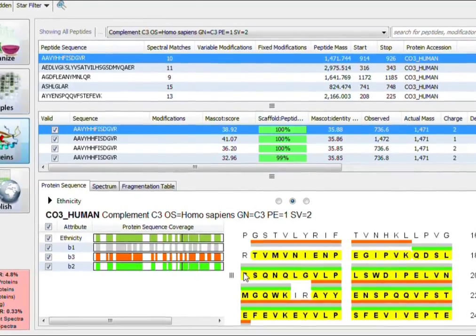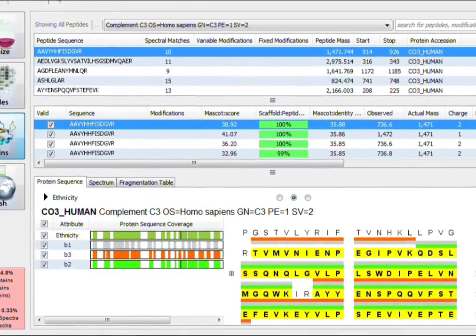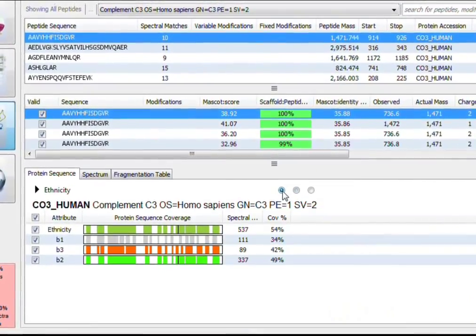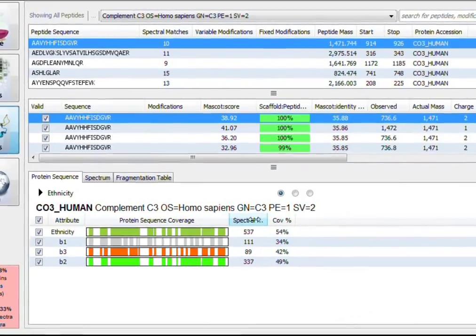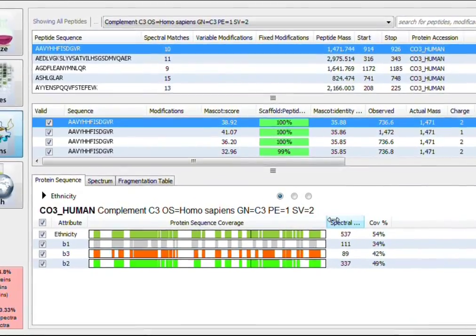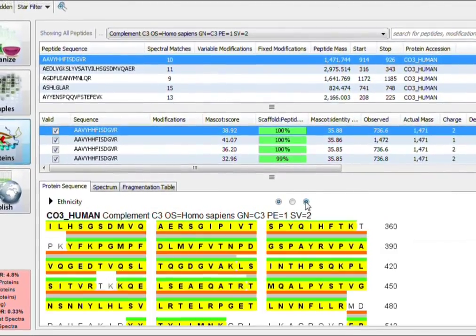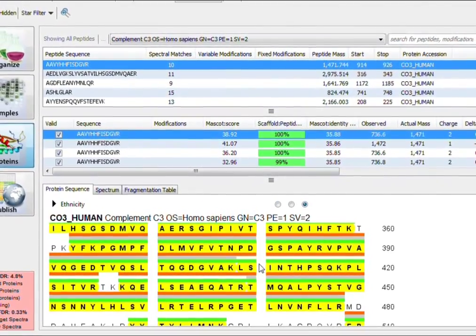See each protein's amino acid sequence and spectral coverage at each summarization level, which can help you further determine significant information in a familiar setting.